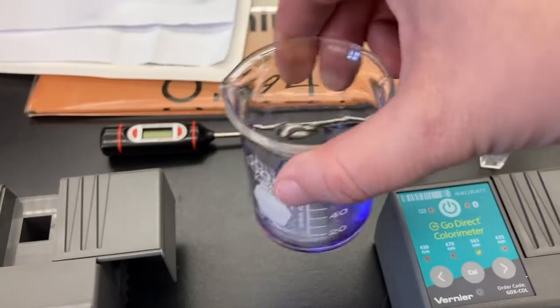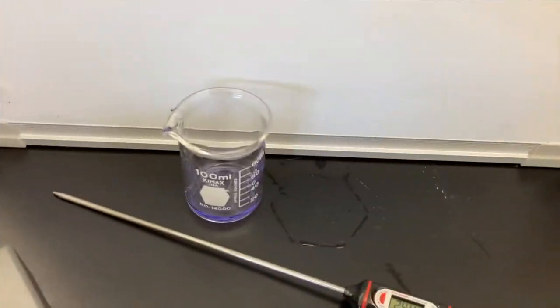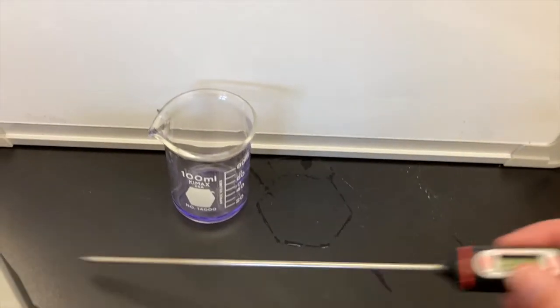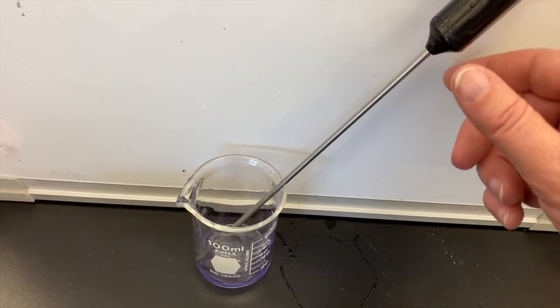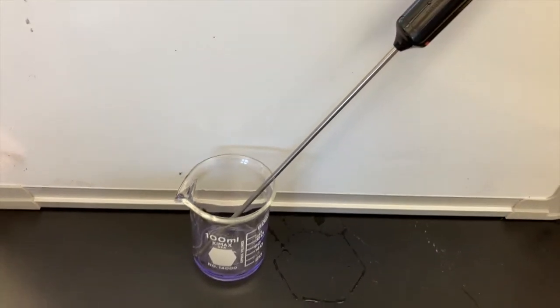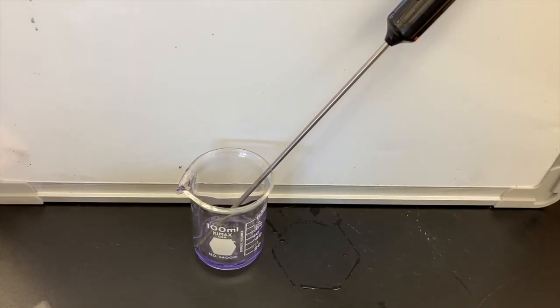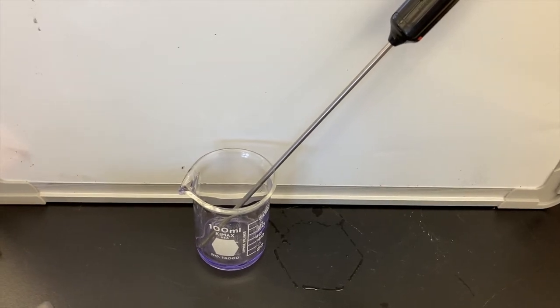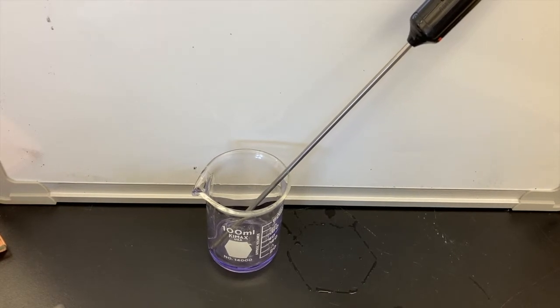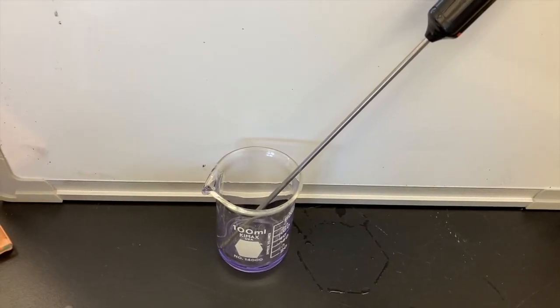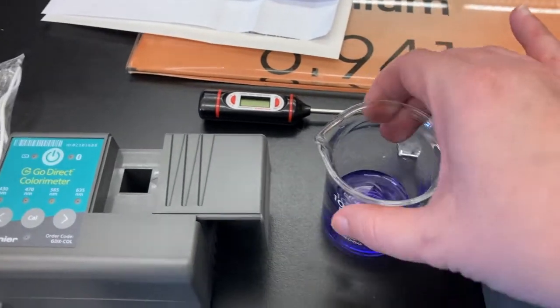Once you mix your reactants together you want to swirl them around, make sure they react for a few seconds. Before you get started on your data collection, make sure to take the temperature of your mixture so that we have a comparison for the colder temperature data. You are going to want to leave that in there at least 20 seconds so that it can calibrate and get to the right temperature. It should be pretty close for the room temperature one, it will take longer to calibrate for the cold temperature one. And then you can transfer some of your mixture into the cuvette.